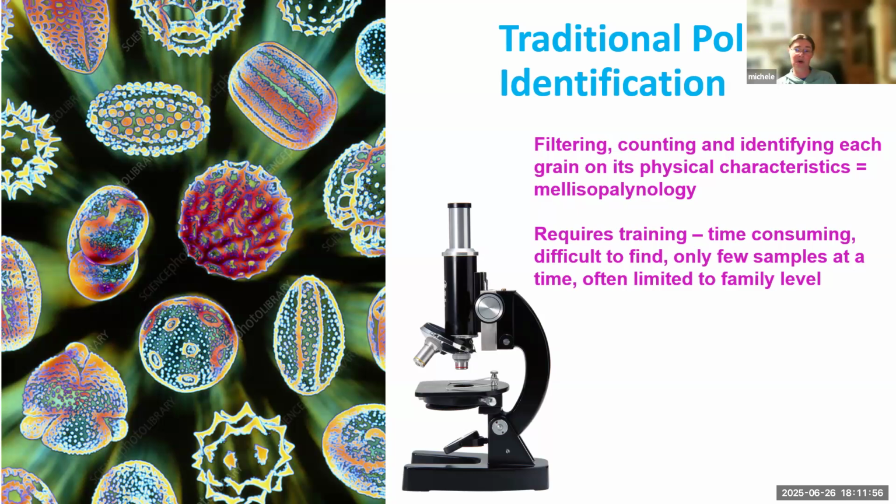And that, to be honest with you, is more of an art even than a science. I mean, it's absolutely science as well, but it requires a lot of training. As the picture might show you, pollen granules look like they have a lot of ornamentation. This is a very stylized picture. Most people who do offer this service, they're similar in that they can probably really only get to the family level. There just aren't enough distinguishing characteristics to distinguish at a genus level. There's certainly not enough to distinguish at a species level most of the time.